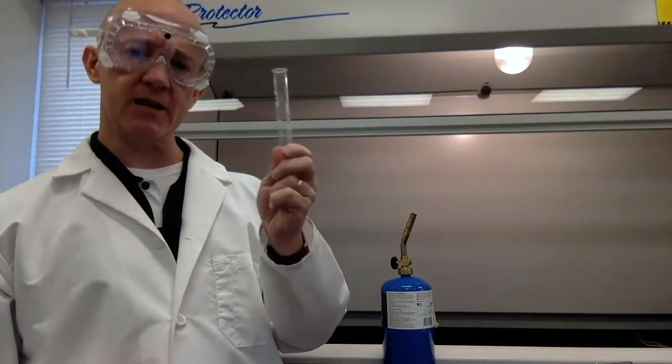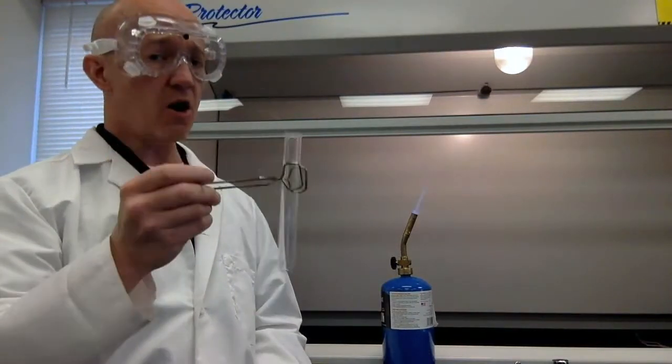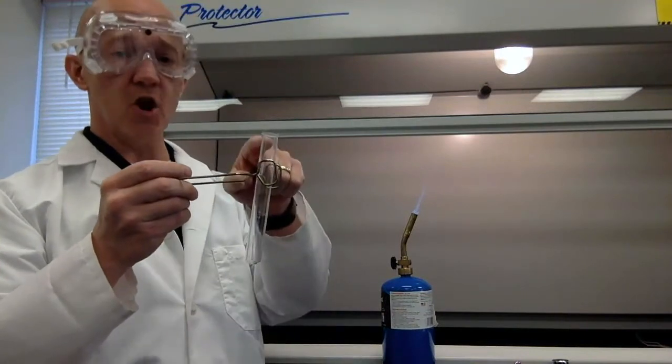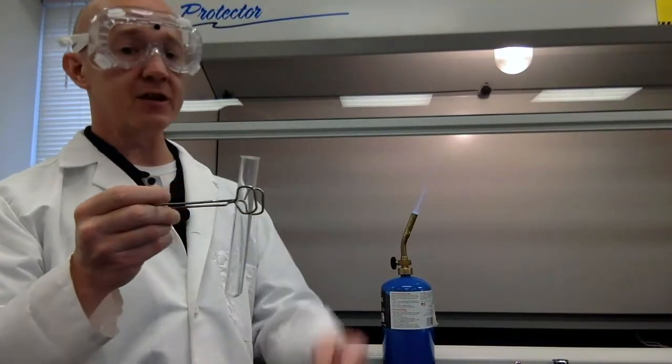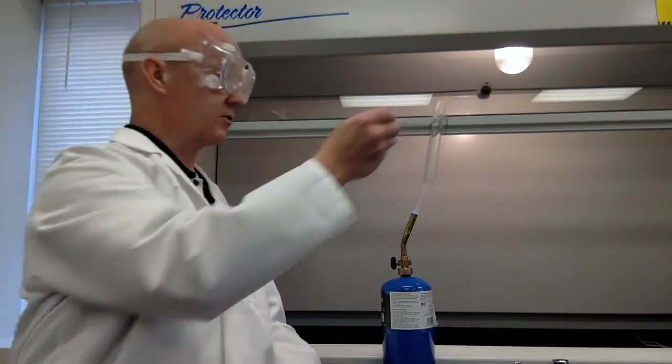If we're heating something in a test tube, first, always use a test tube holder. Come on. Like that. And then as you're heating the test tube, always, always make certain that the opening of the test tube never faces you or anybody else.